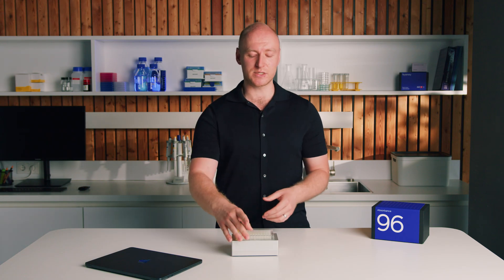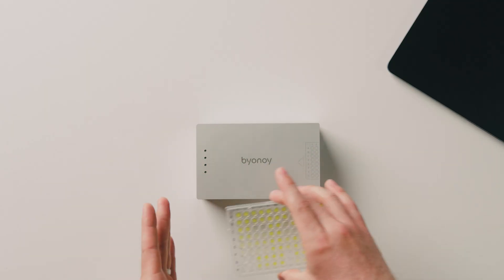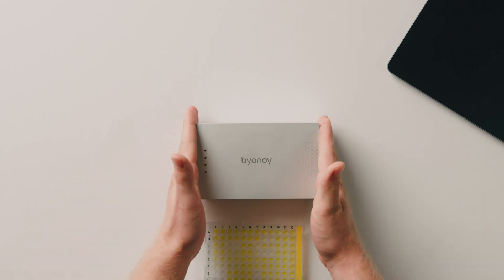As you can imagine, if you need to move the microplate back and forth even one time, you automatically need double the area of the microplate. That's the secret of how we were able to build this device so compactly — we don't need to scan across the wells because we read everything in parallel. We have 96 light sources and 96 detectors, and that's ultimately what allowed us to build the device so compactly.